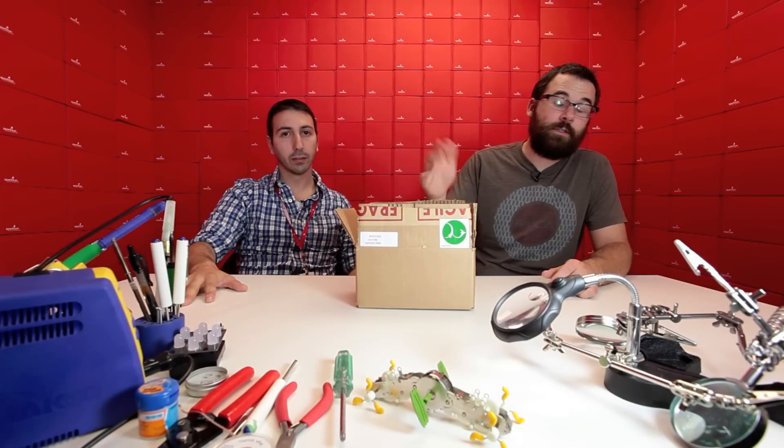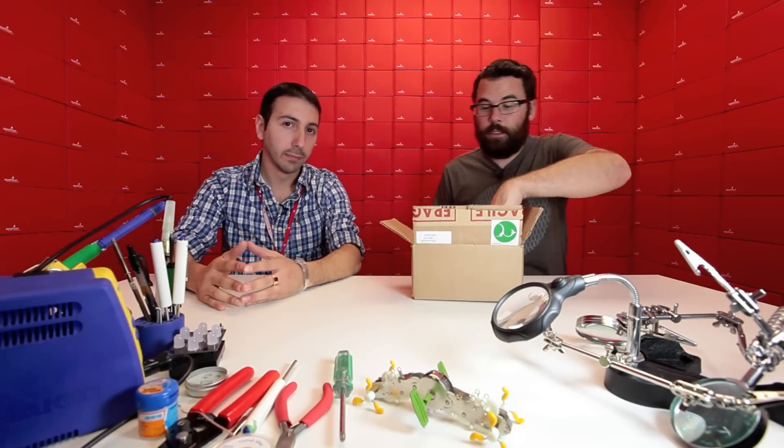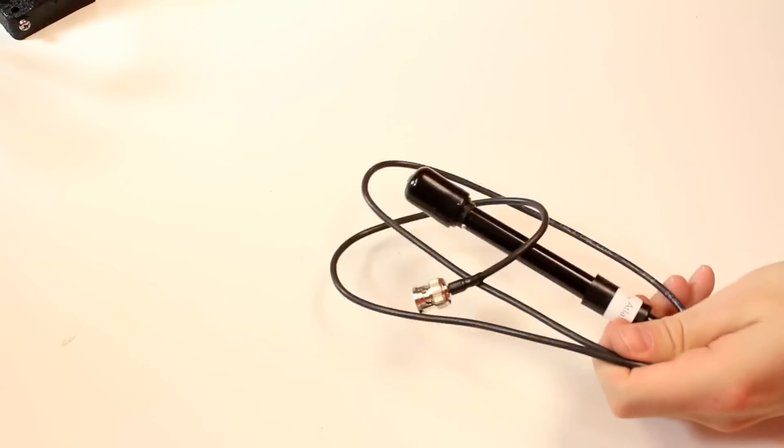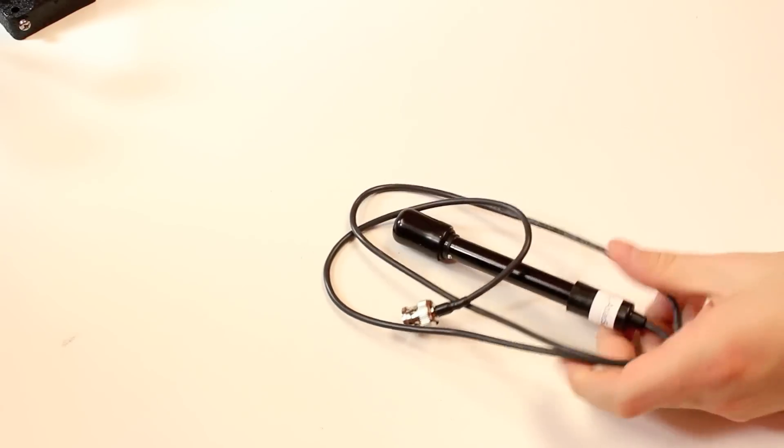This next kit is a dissolved oxygen kit. Very similarly to the electrical conductivity kit, the dissolved oxygen contains a probe, which, all these probes are different, of course, right? And we've got this. This is a little different. Can you explain that?